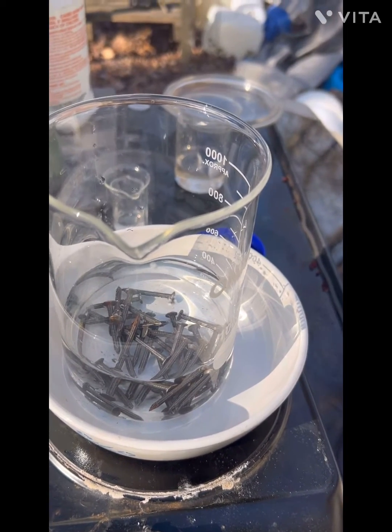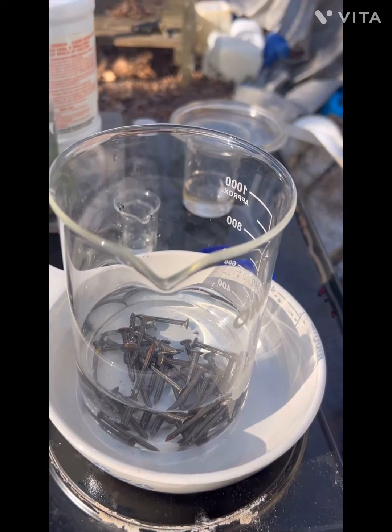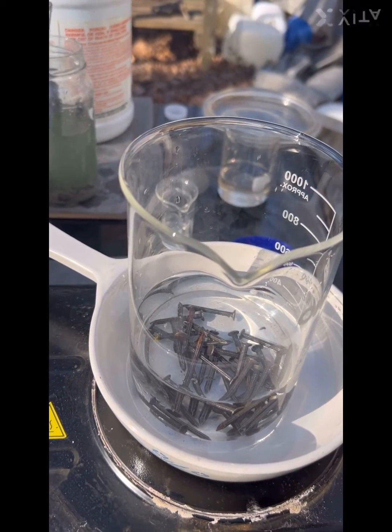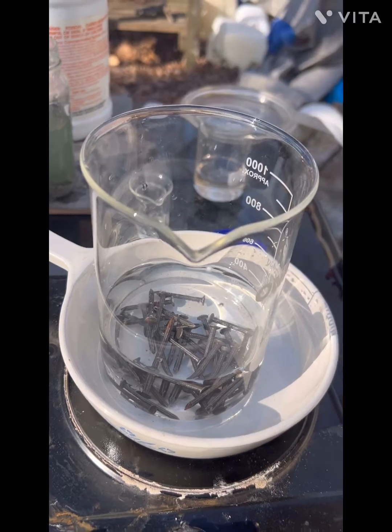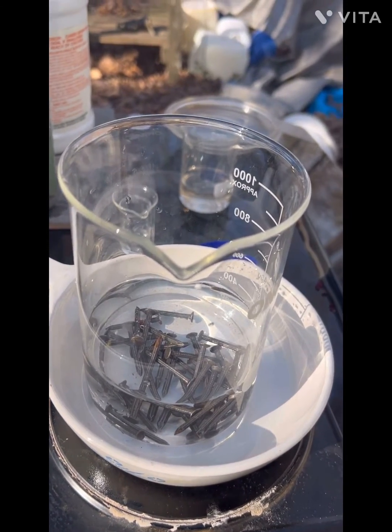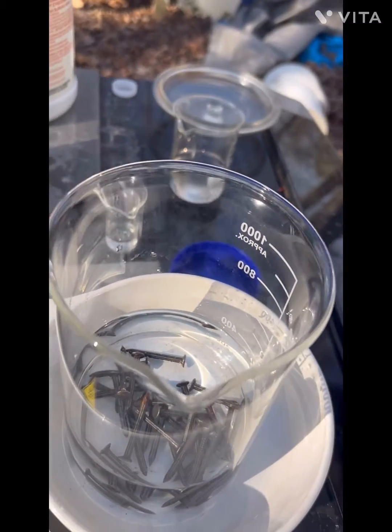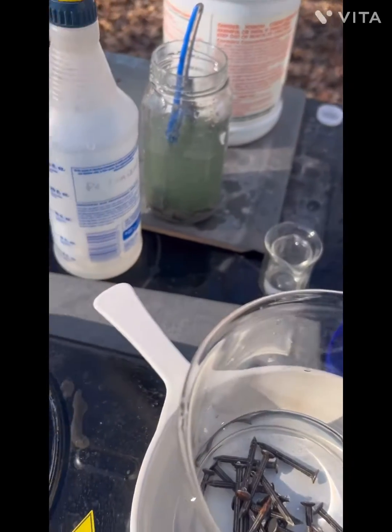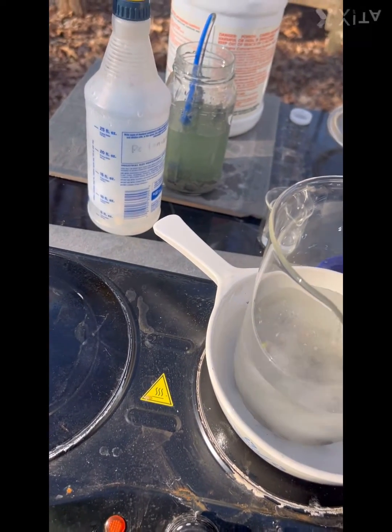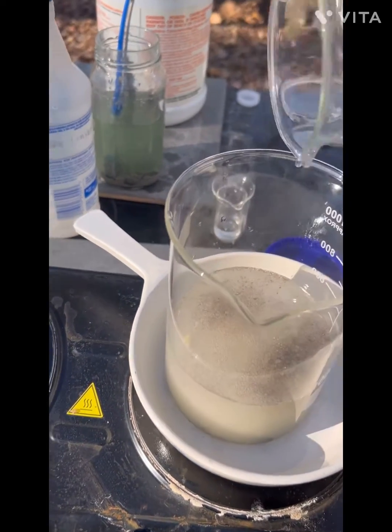Here we are again — iron sulfate revisited, number three. This is 300 milliliters of water and 100 grams of nails. We're going to put on our safety goggles and add this sulfuric acid — it's 100 milliliters. We're going to do that real slow. There you go, a little bit of a reaction there.